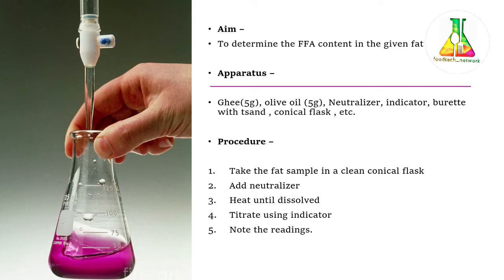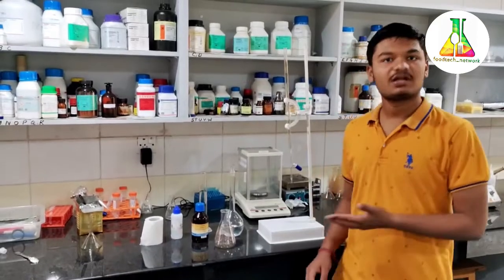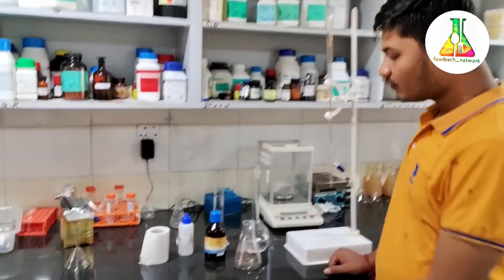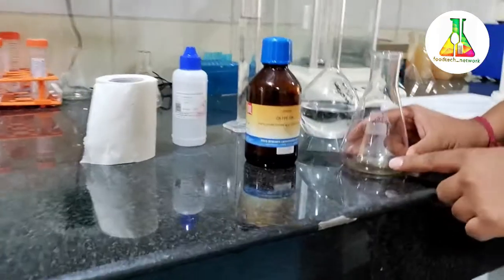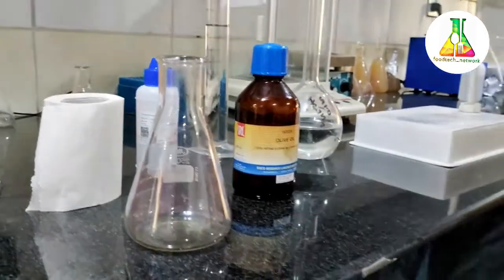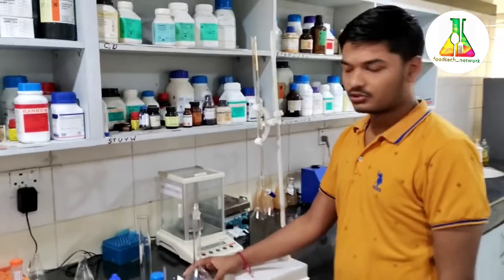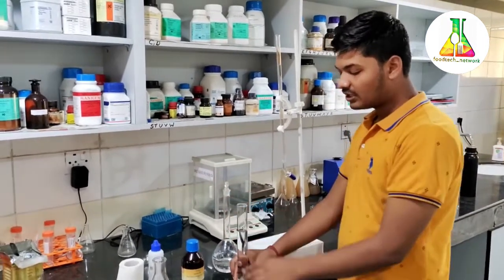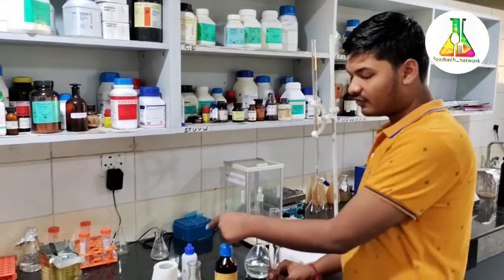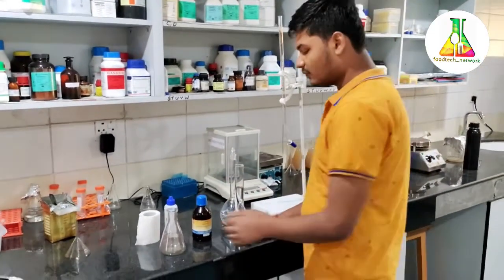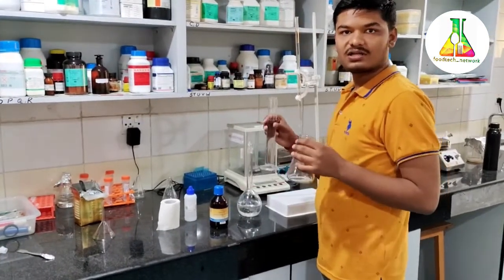We need to take the fat sample in a clean and dry conical flask — five grams of the fat sample, beginning with ghee and then olive oil. We need to add the neutralizer, heat it until dissolved, then titrate using an indicator and note the readings. For this test, we need: olive oil and ghee as fat samples. In a 50 ml burette I have filled 0.1 normal sodium hydroxide solution. The neutralizer is ethanol — 50 ml per five grams of fat sample. Phenolphthalein indicator is used for color change.